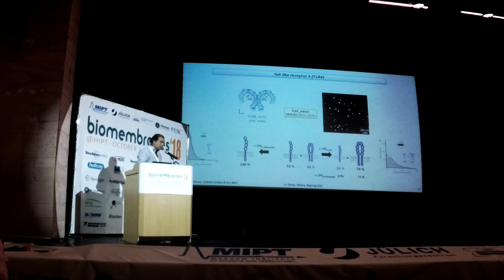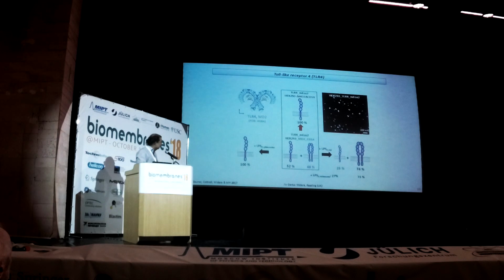And apparently at the receptor level, it already stops any kind of signaling with a very different organization of the hub, of the central hub of receptor activation. And we can put that into a model, in a very simple model, of how the receptor organization changes depending on the 3 LPS molecules we studied. And there are hundreds of more. And you could probably combine that with the next proteins which come down here, which we haven't done yet.